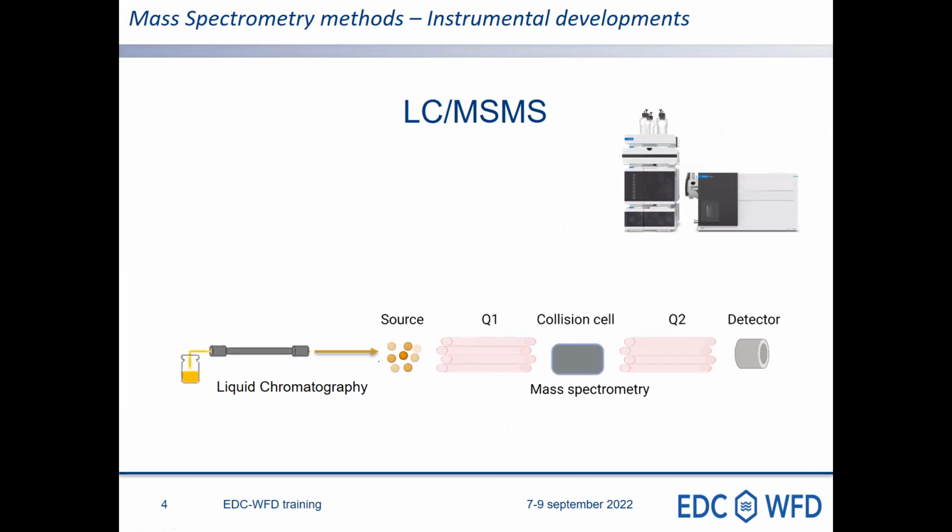Even if APCI or APPI could be relevant because of the instruments available, with respect to the purpose and objective of the project, meaning to have standardization and build a standard, we saw that electrospray was really the most relevant approach to investigate in depth. So we only focus on electrospray.